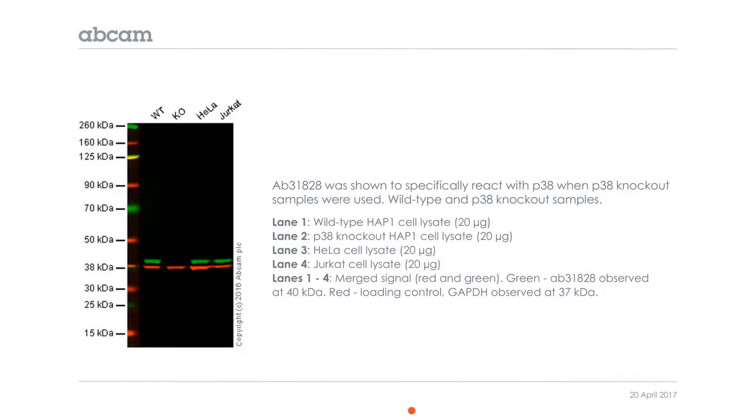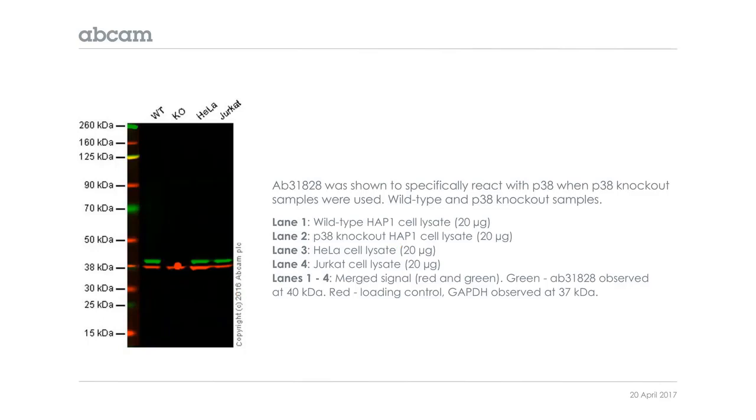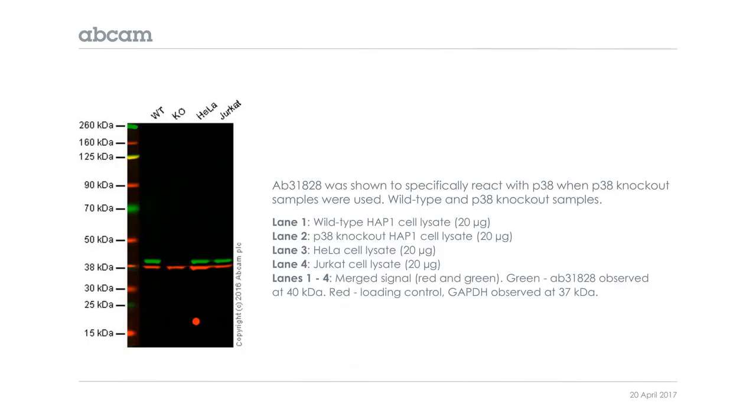And it also has this Western blot knockout data, which is something you'll see on some antibody data sheets. It's fairly rare, but when you do see it, it's a nice piece of data. In this case, they were comparing lysates of this HAP1 wild-type cell lysate versus the P38 knockout. And that's what you see in the green here, missing from the knockout. And the red is a loading control GAPDH, just to demonstrate even loading of total protein across all four lanes. And then you have the HeLa cell lysate and Jurkat cell lysate. So this is a good-looking Western blot. There's not a lot of cross-reaction with other proteins, either higher molecular weight or lower molecular weight. There's simply one band showing up where you'd expect it for P38, and no detection in the knockout.